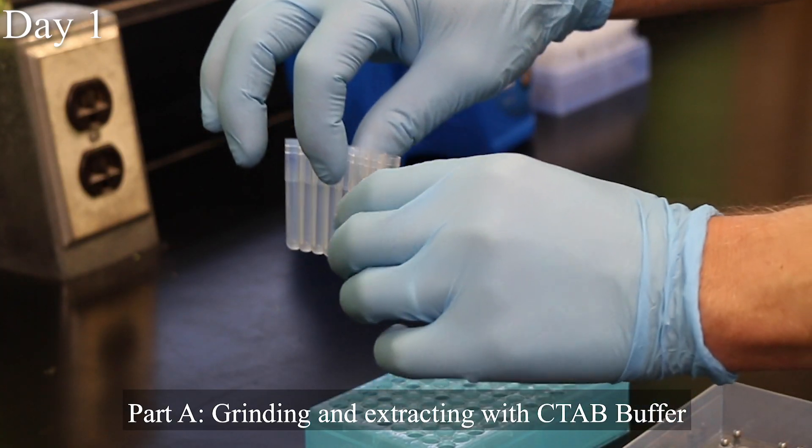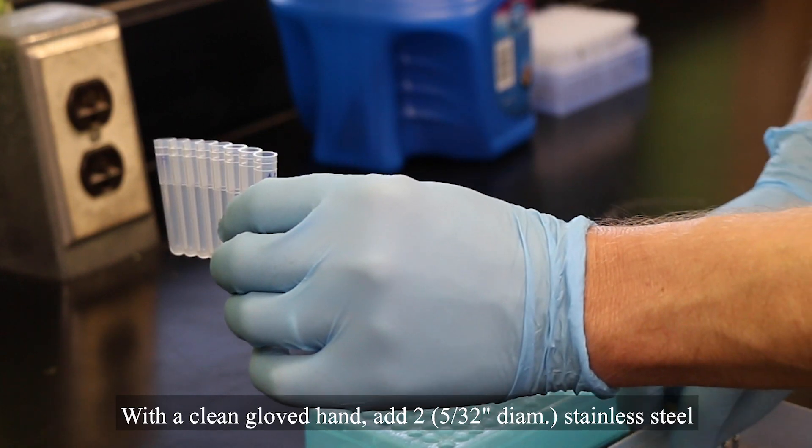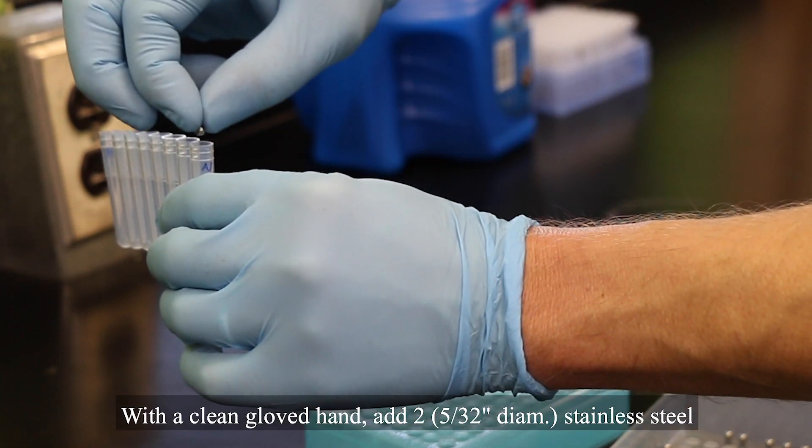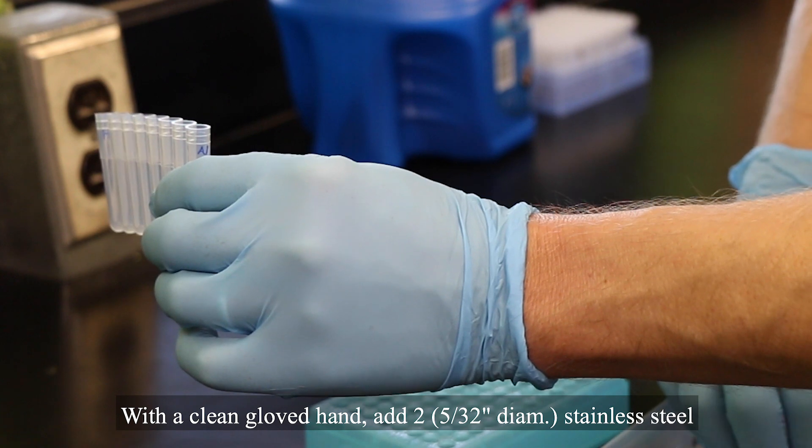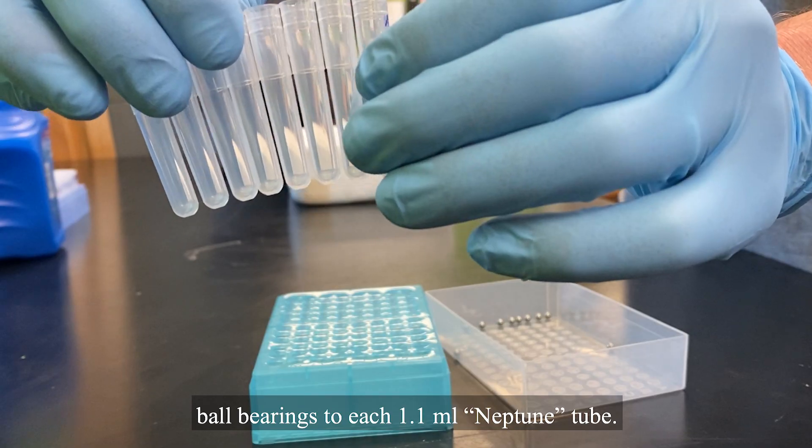Part A, grinding and extracting with CTAB buffer. With a clean gloved hand, add two 5-32 diameter stainless steel ball bearings to each 1.1 mil Neptune tube.